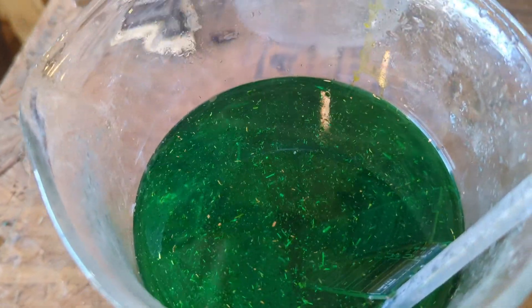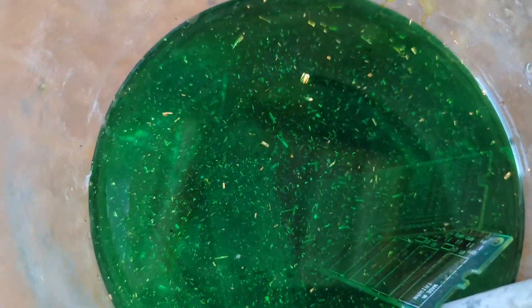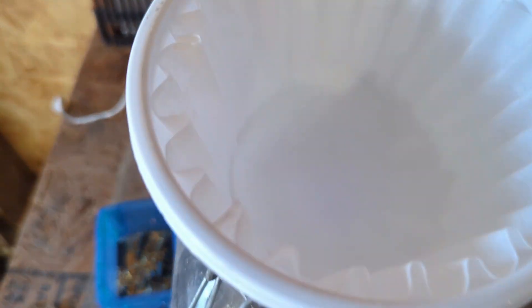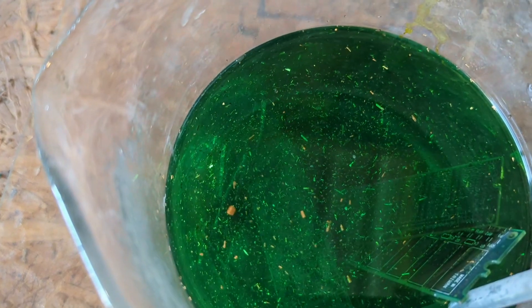We'll go ahead and filter that out. Any gold foils that are still stuck to the RAM and the fingers, we'll give them a little spray with some distilled regular water, and we're just going to be pouring them through a regular coffee filter in a funnel to collect those gold foils.